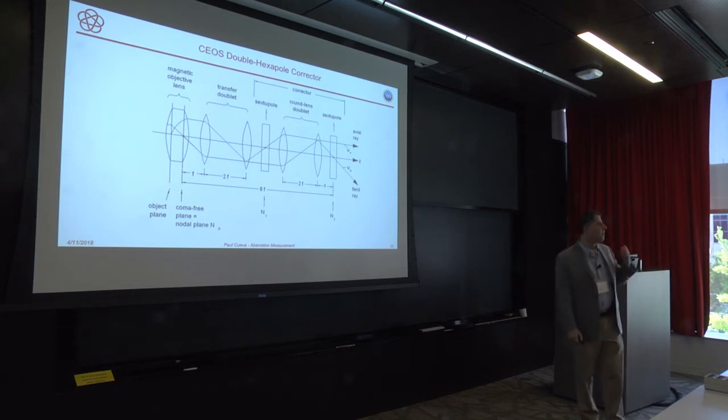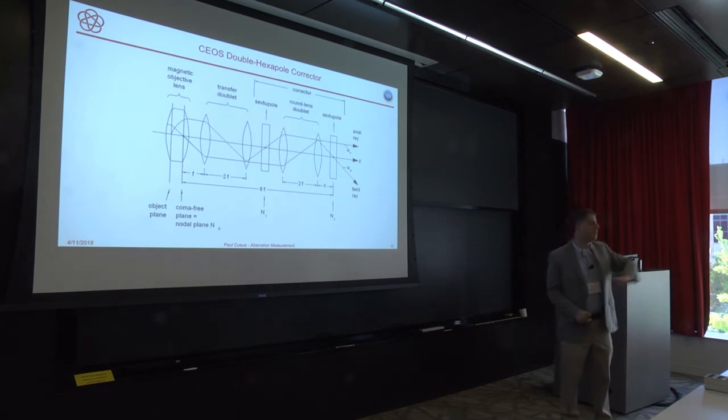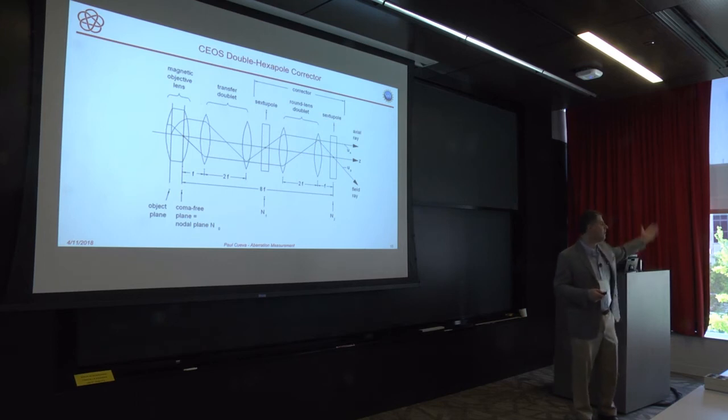Because by the time they built it, they didn't have good enough precision on the machining. And then by the time you've lined up lens 81, lens 1 has drifted out. The precisions you're talking about are parts per billion on the current. So you have to build a power supply that's supplying 2 amps with a part per billion stability, right? So you're talking nanoamp stability on an amp power supply.